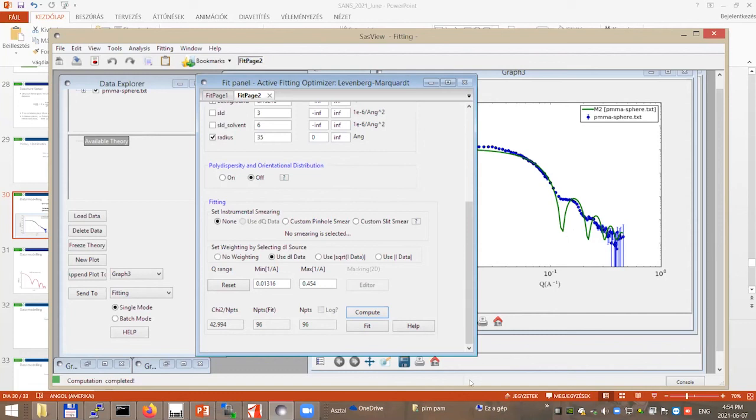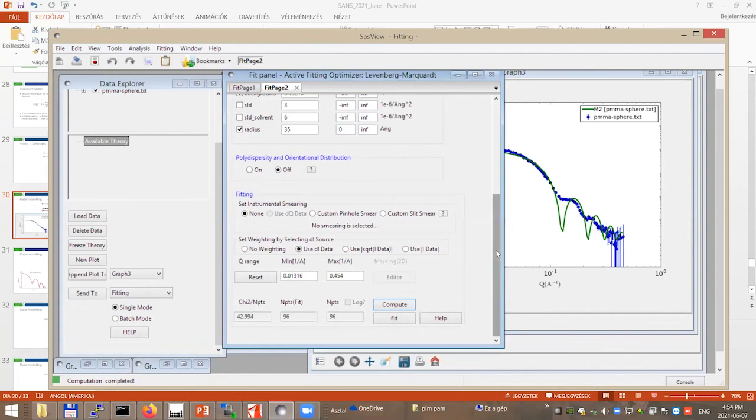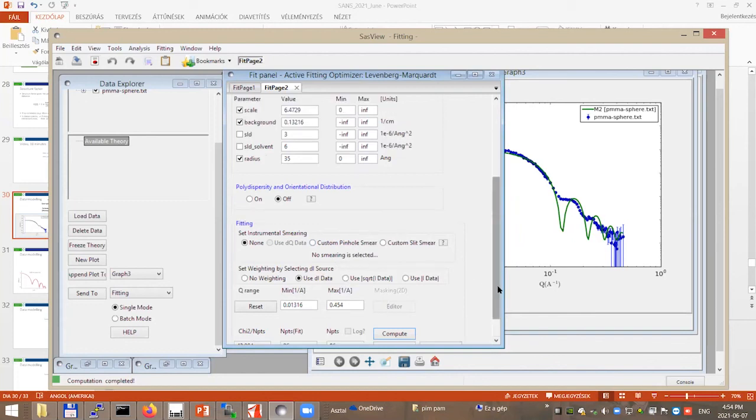If you remember the pinhole and the sample, what I showed in the movie, even the pinhole has a size of 1 centimeter. This means that neutrons coming from different directions all scatter and all contribute to the scattering. So this leads to a smearing of the resolution. It's not absolutely good. And for this, there is a way to take it into account.